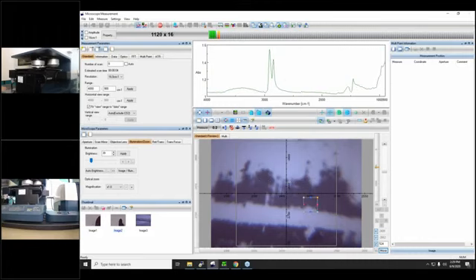But when I move it to this region, we are going to see that the signature is going to change, and now we see a totally different spectrum. So I already know what the areas are where I would like to do the measurement, or the location where I want to do the measurement. So I already know that around here there is one polymer, and I'm going to click there. So I'm going to collect the data there.